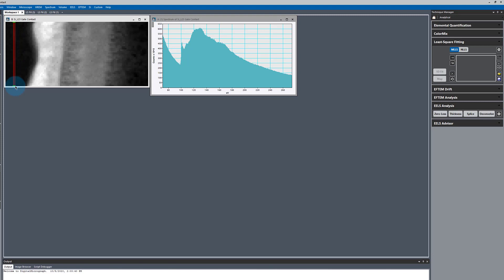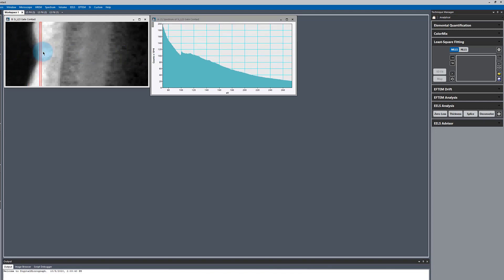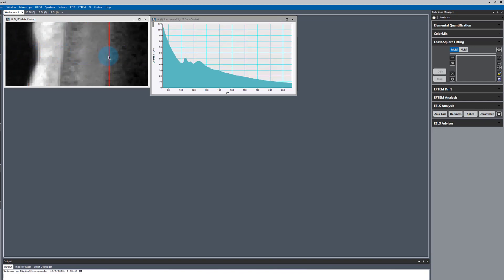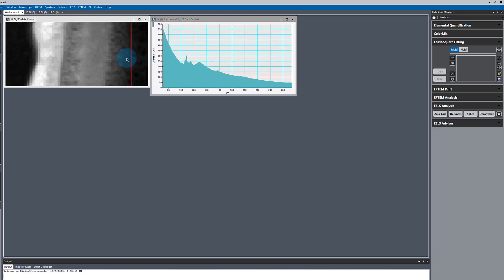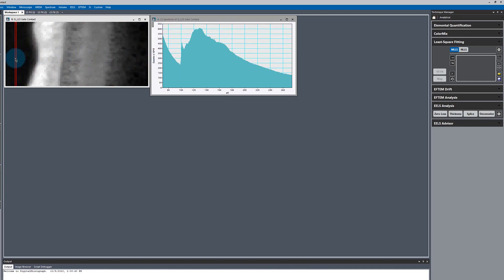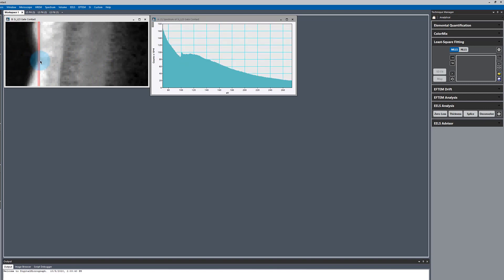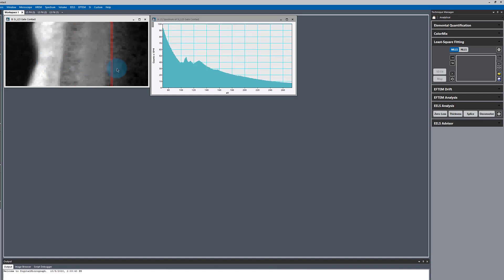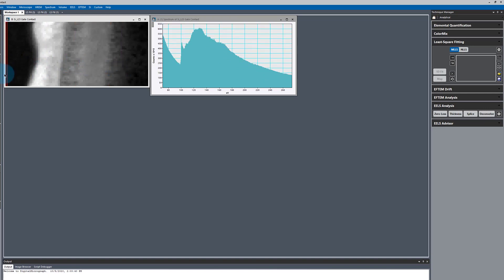Now let's do another spectrum picker tool. There's two other approaches in dealing with the background. If our sample is very uniform in thickness and we have just changes in phase, it's often simply enough to keep the background the way it is. So the background in this region is the same. It's different than this background, but it's the same as everywhere else, and so on.